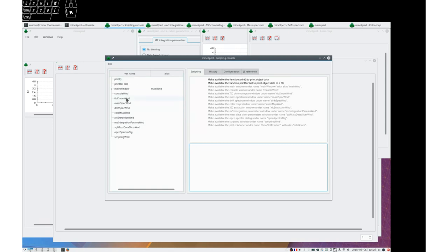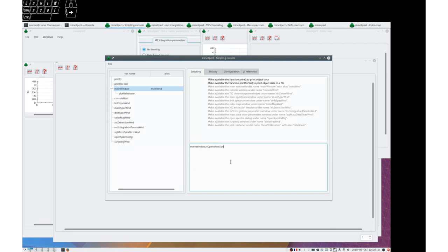Let's ask main window to javascript open mass spectrometry file. For example, home. Right.